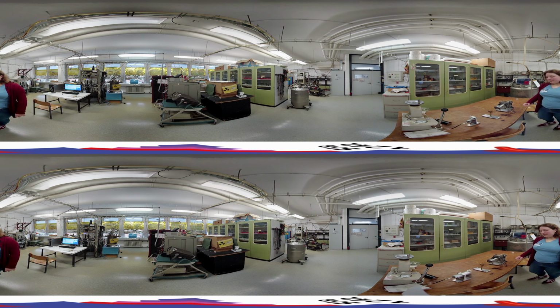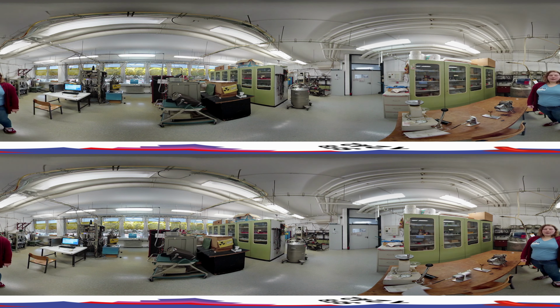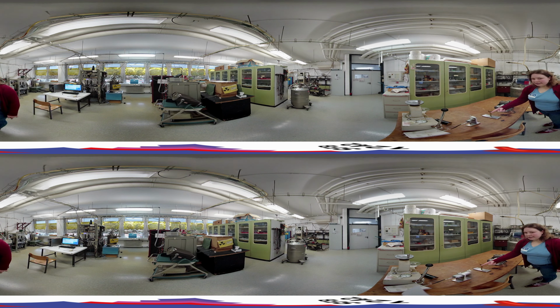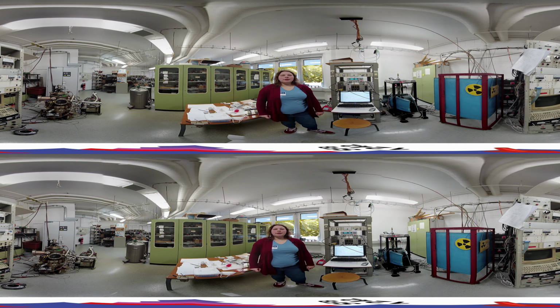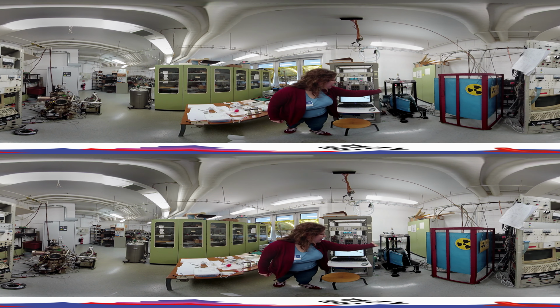So gamma rays are emitted by the source and hit the sample. Rays that don't match the energy gap can pass through the sample and are detected by a proportional counter. So we will see a negative signal every time absorption conditions are met. In this lab we see several different iron-57 Mössbauer setups, and I will be focusing on this setup here.